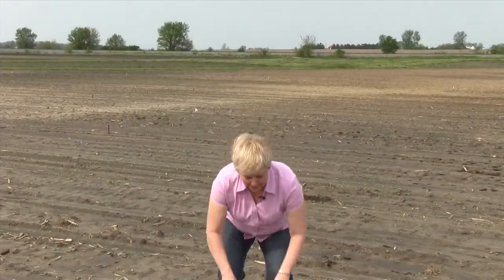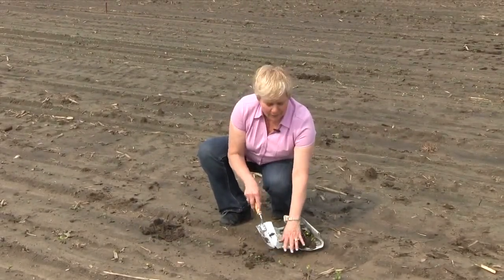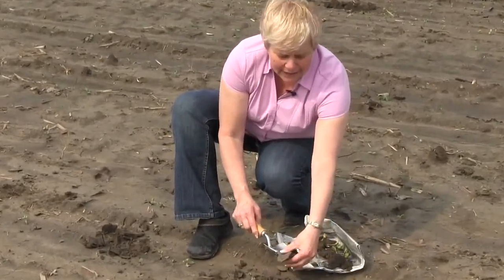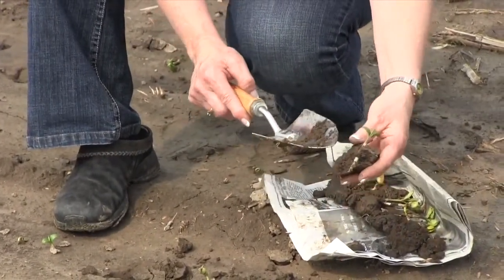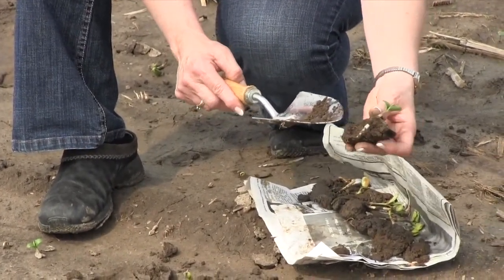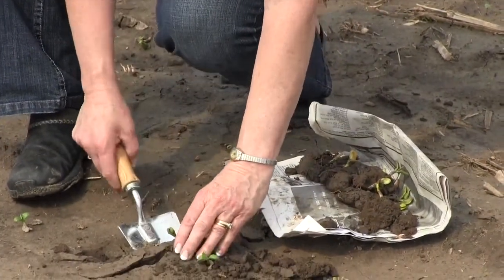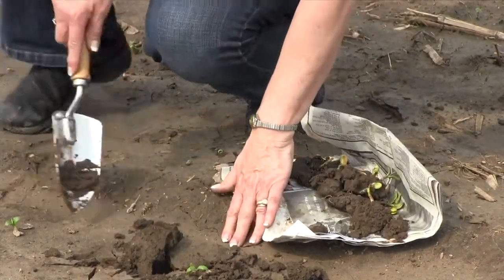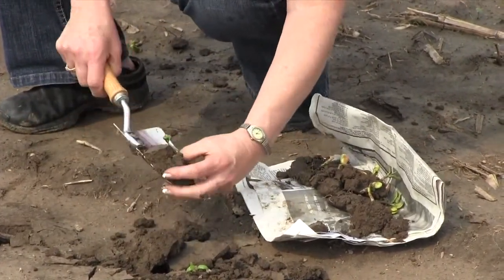To take an accurate sample, what we want to do is be sure you take a number of different samples that show representative symptoms. So you want to dig a sample that is emerging well, and you want to leave the soil around the sample so that when it comes to the lab, we can get an idea of planting depth and any problems agronomically that might be contributing to the symptoms that you're seeing. We like to have at least a dozen plants, and we don't want you to wash these samples off because we want to be able to see the sample just as you have dug it from the ground.